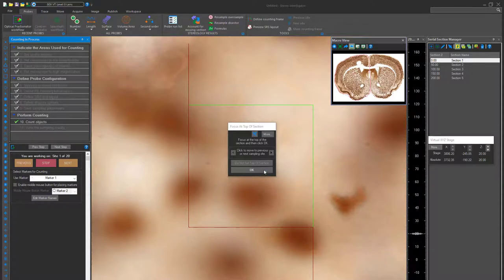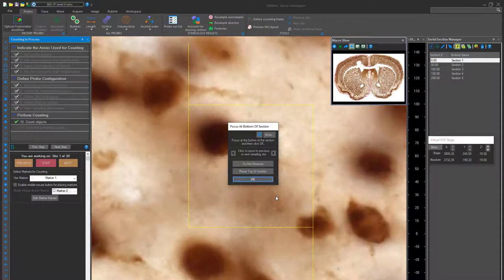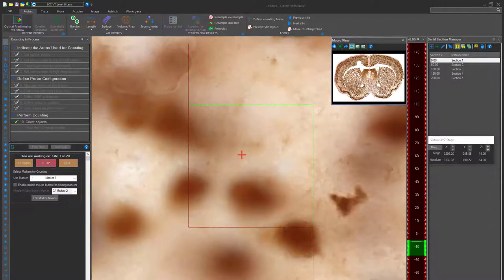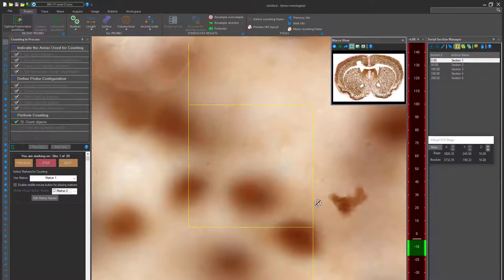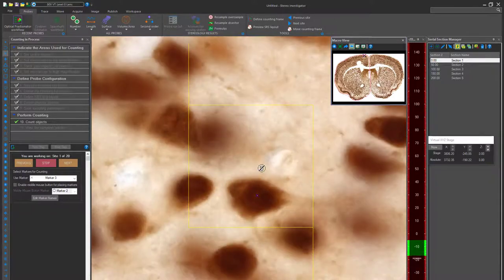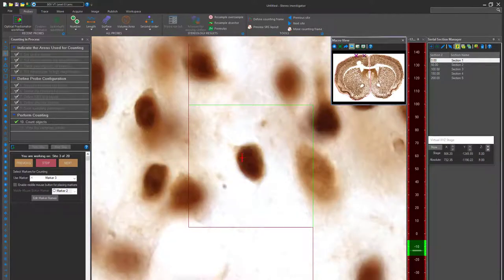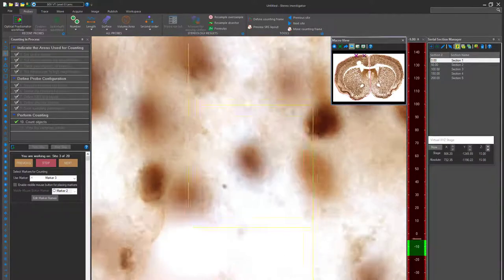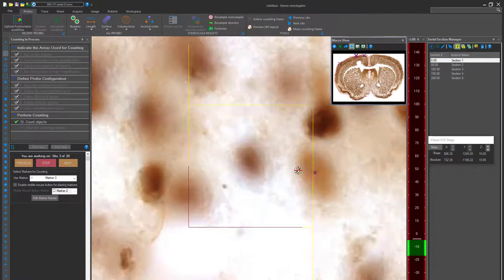Scroll down through the image and place a marker any time the top of the cell comes into view within the dissector. If the top of the cell is already in view when you start scrolling, don't count it, and instead move on to counting other cells.